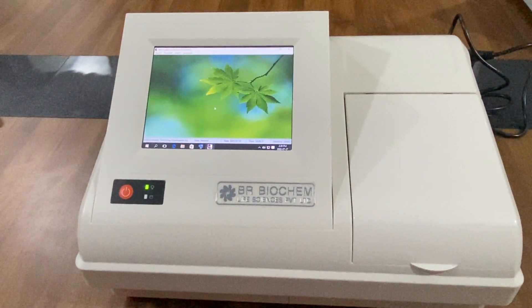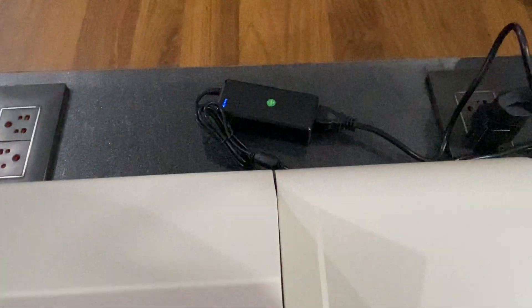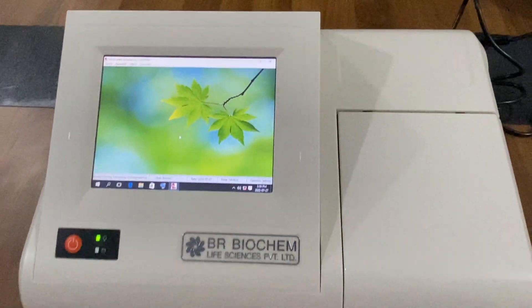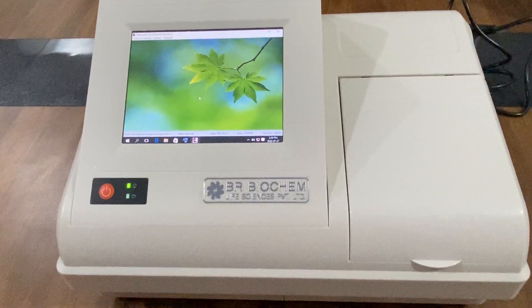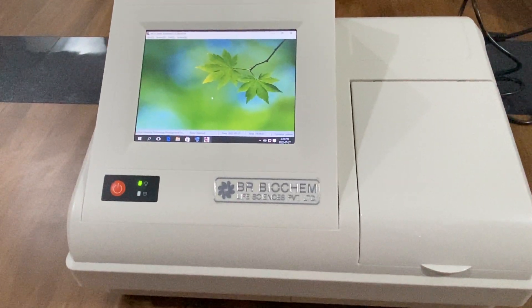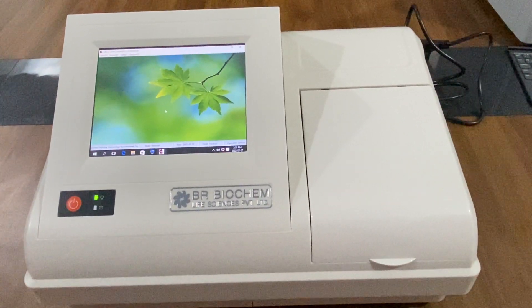This ELISA reader has a wavelength range from 400 nm to 750 nm. We provide a maximum of 8 filters in this ELISA reader. The 4 standard filters are 405 nm, 450 nm, 492 nm, and 630 nm.